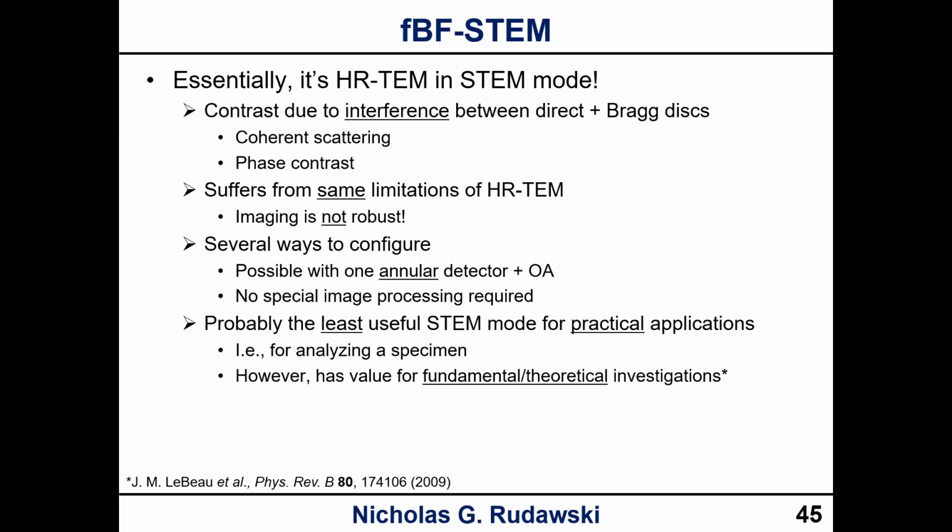But I think without question, this is probably the least useful STEM mode for practical applications. So if you're trying to analyze a specimen, this really isn't going to help you much. Where this has value, though, is for doing fundamental theoretical investigations about STEM. And actually, this is one of the papers that did this.